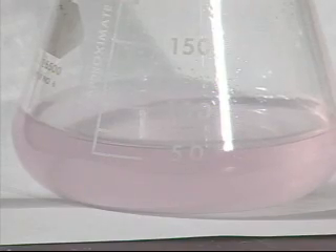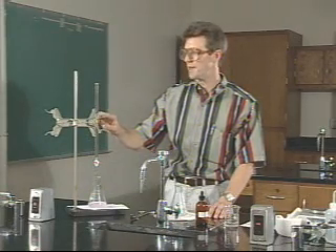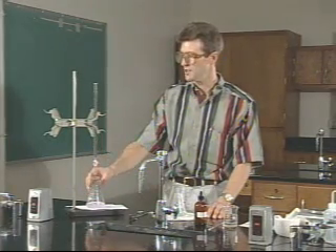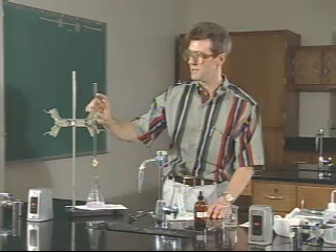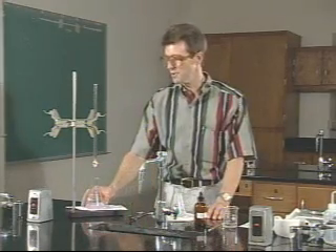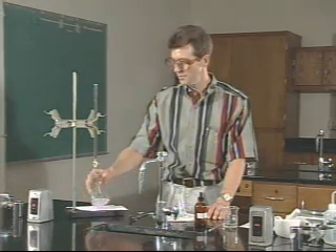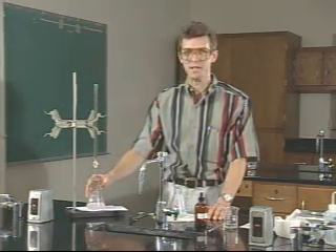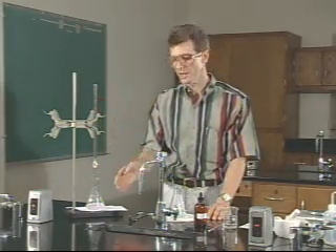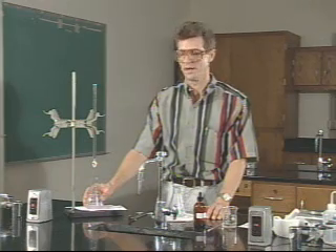It has turned a very pale pink. If you overshoot the endpoint, the pink will be very bright and you've probably added too much. What we have here is a fairly decent endpoint with a nice pale pink color. If the pink color persists, we have definitely reached the endpoint — and it is, so the titration is finished. We end by taking a specific reading of the final volume in the burette. The volume of sodium hydroxide used to titrate the remaining HCl is the difference between the final reading and the initial reading.